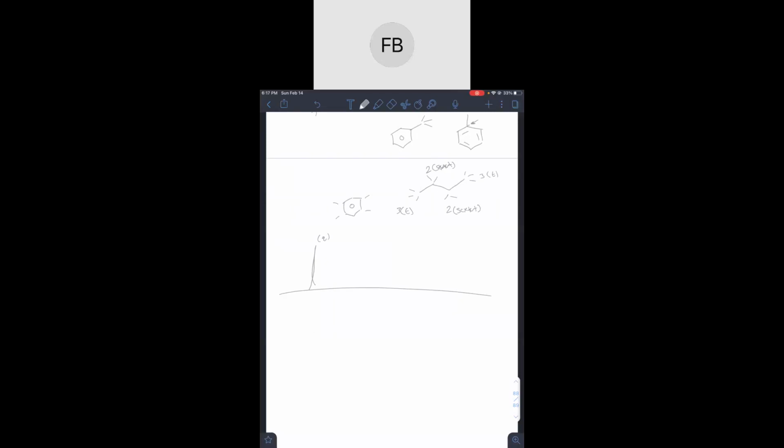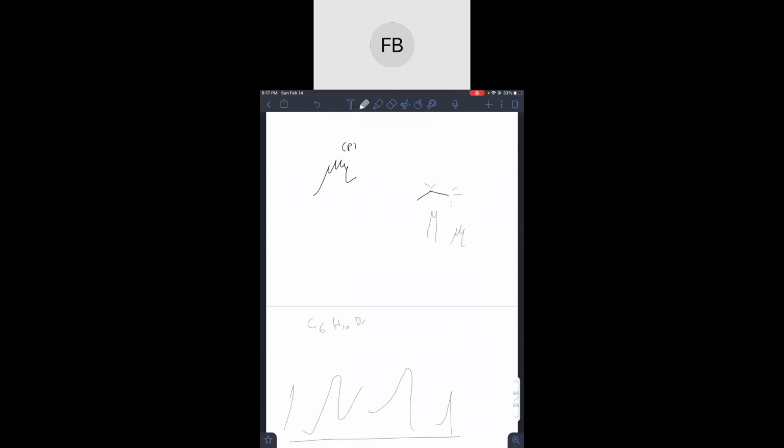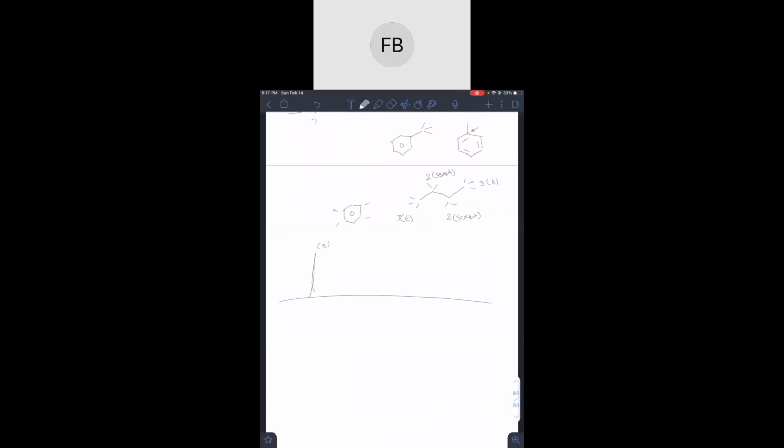So this example would be a quartet. It would have 4, or how do we say Q? Let's see, 4. Yeah, quartet. It would have 4, like that, because you can't see that on the graph. So this would have 4, and what does that tell us? That tells us that an aromatic ring only has 4 hydrogens on it. So that means there must be something coming off of each end, right? We don't know what yet, but there must be something because only 4 of them are available.